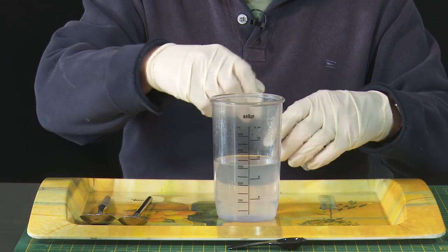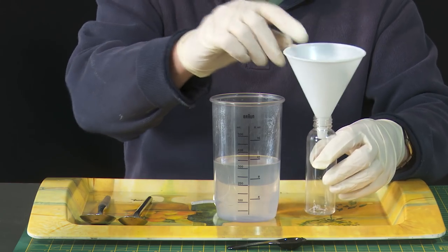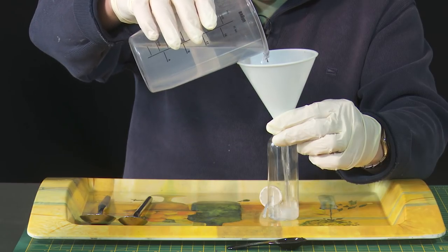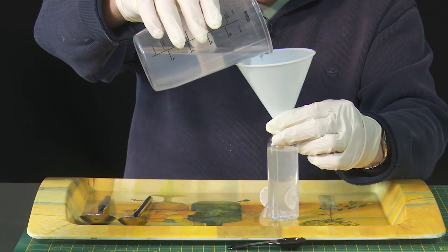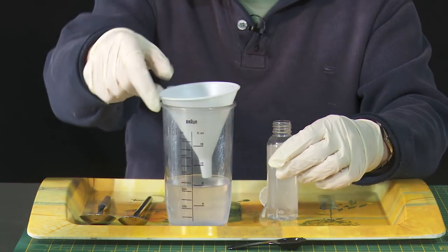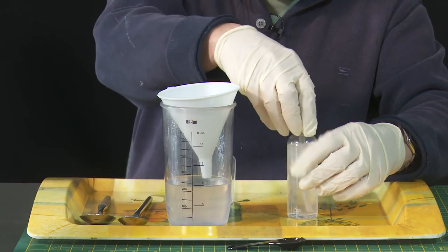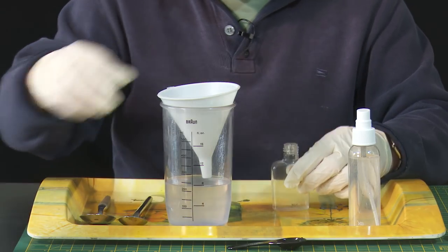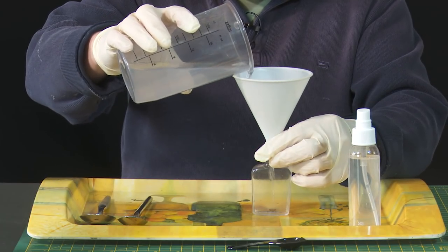Of course we need to get it into some kind of bottle where we can use it. This is a 100 millilitre bottle, so I'll pour it in here. I've also found a couple of little 50 millilitre bottles and I'll pop some in there.